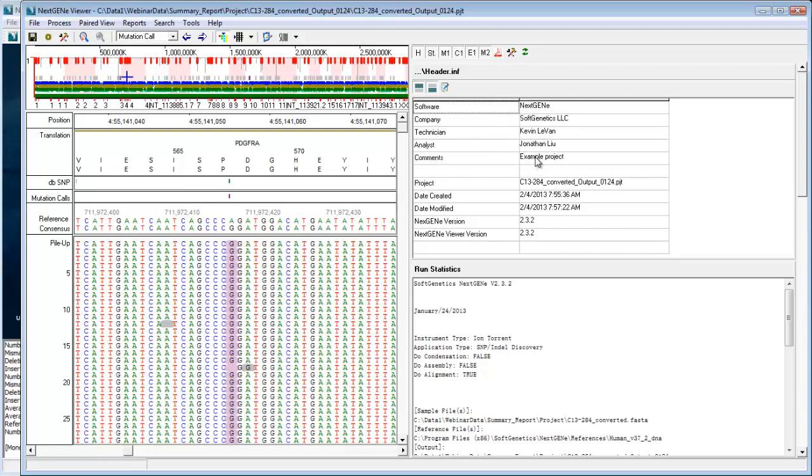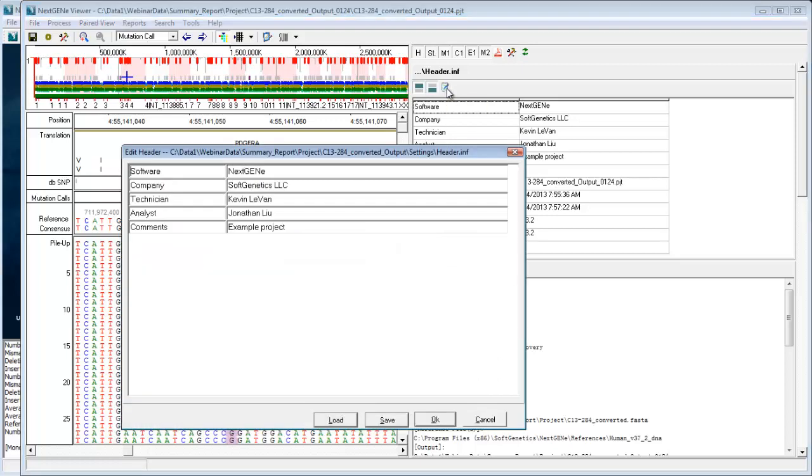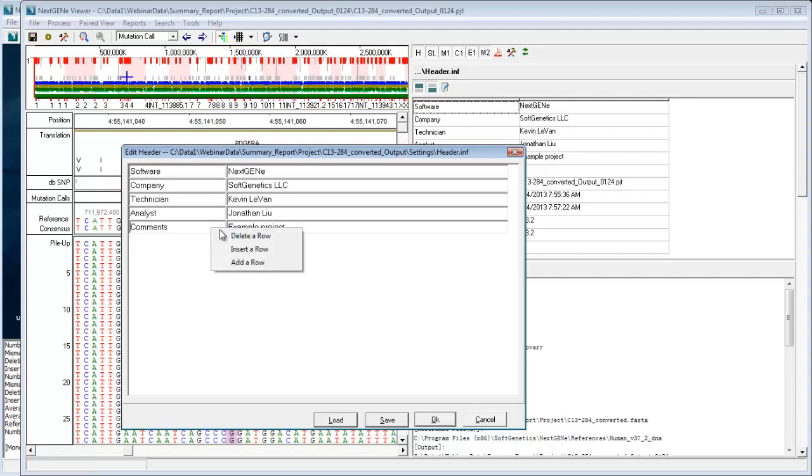And to edit this custom section, you would just click on this edit header button, and that's where you can add your own custom information. Just by clicking on the right mouse button, you can delete rows, add rows, and then load and save these.